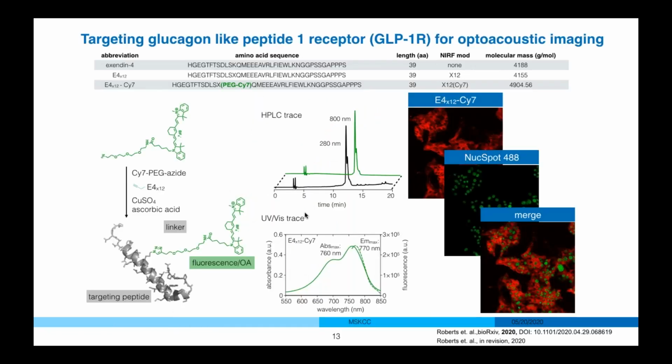The scheme shows the last synthetic step on the left-hand side, which is the bioorthogonal copper-catalyzed click reaction with cyanine 7 as our optoacoustic tracer of choice.